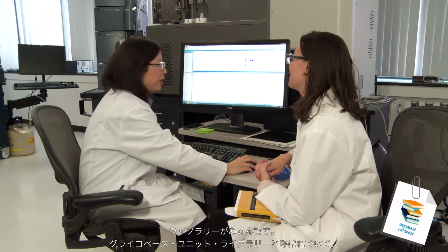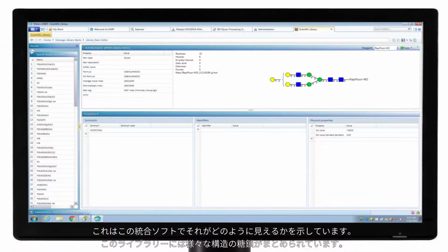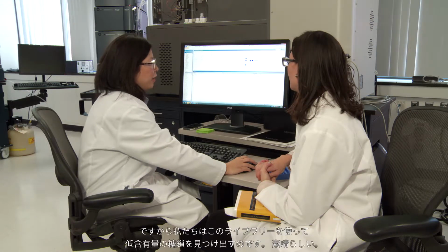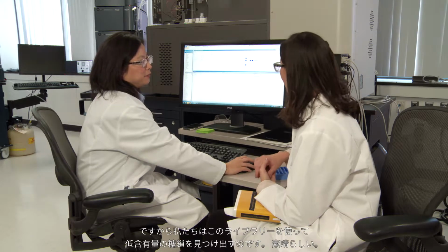Glycobase Unit Library, and this is what it looks like in this unified software. So in this library, there are different glycan structures compiled, and each unique structure has a unique retention time and accurate mass. So we can utilize this library to look for those low abundant glycans. Great, let's take a closer look.